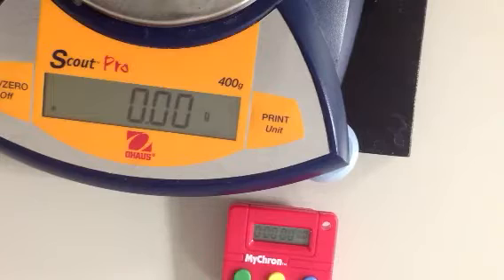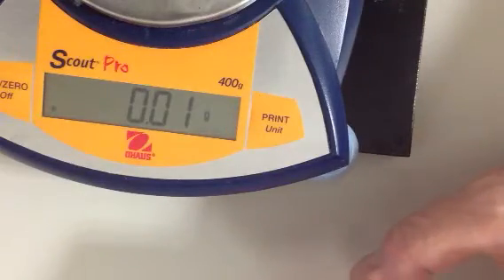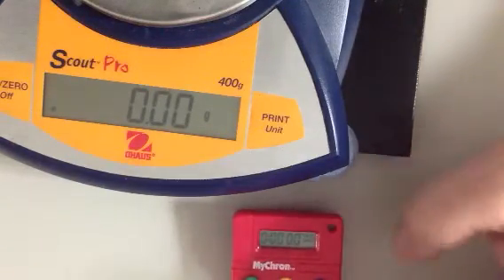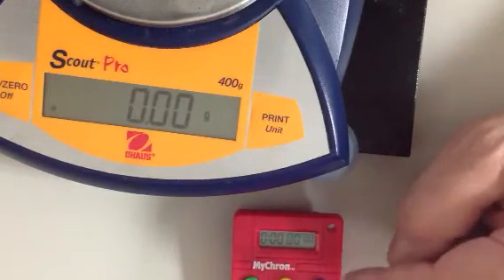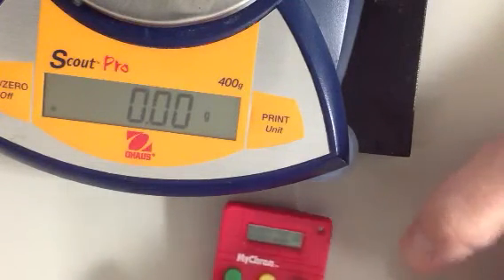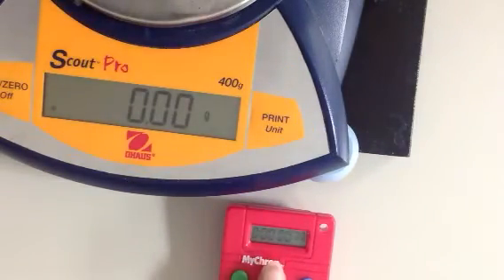So, here we go. I'm going to take this off. As soon as I pour that in there, thank you. Sonia, as soon as I pour it in, you're going to push the on button, or start. Oh, you're right, start. Why don't you practice once? Press, yep, that does it. Stop, and then reset. You got it. Okay, we won't need the reset anyway. You're just going to press the start button as soon as I add this to there, right?